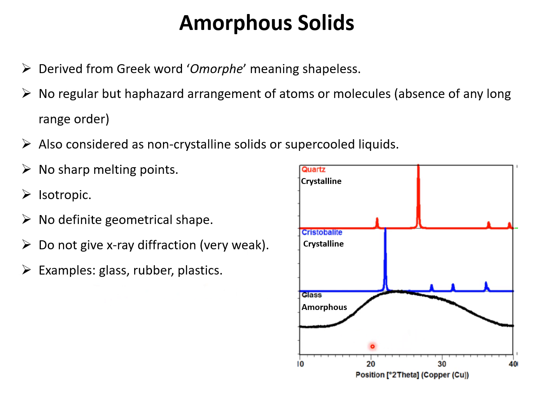So if you look at this X-ray diffraction pattern, if the solid is highly crystalline, you will get a sharp peak like this, whereas amorphous gives a broad one. So with the help of the X-ray diffraction pattern, one can easily distinguish which is amorphous and which is crystalline.